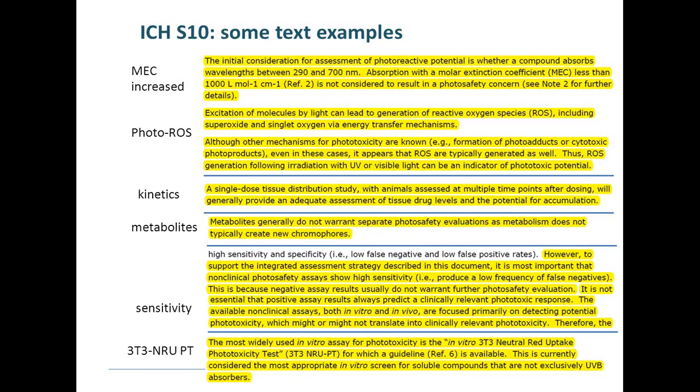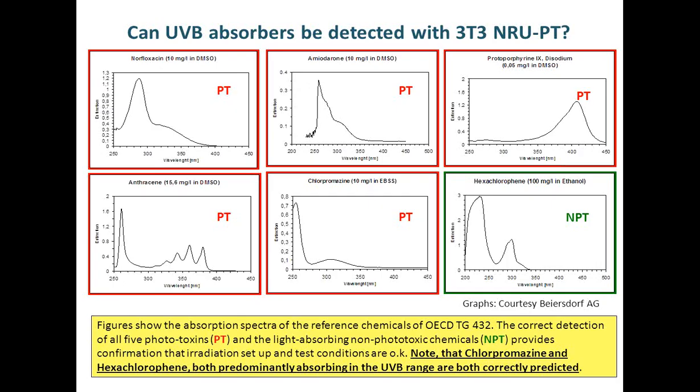That's what we know. Of course, then you have to filter your sun simulator differently. We know a filter that we can use with the Sol 500, the lamp that we are using for the 3T3, but maybe other filters for other equipment. Next slide, please.